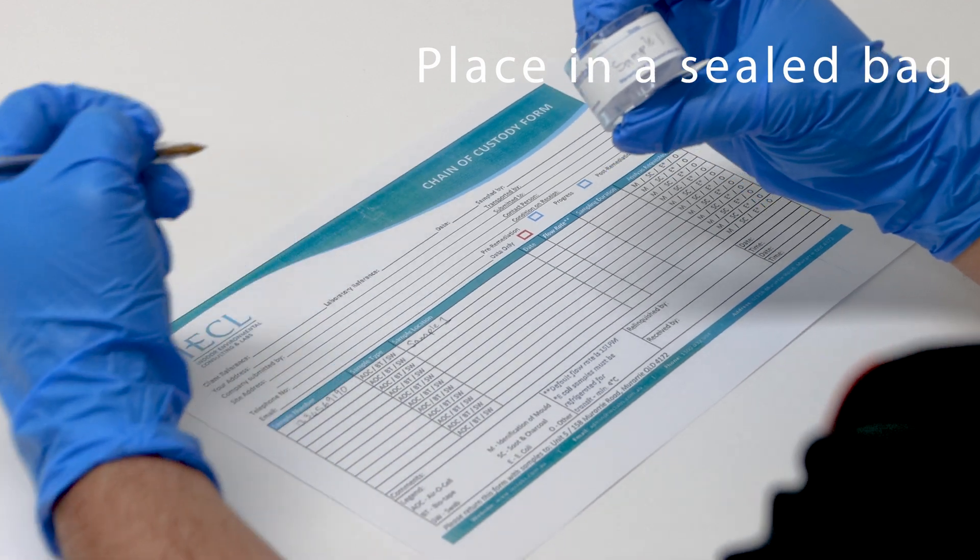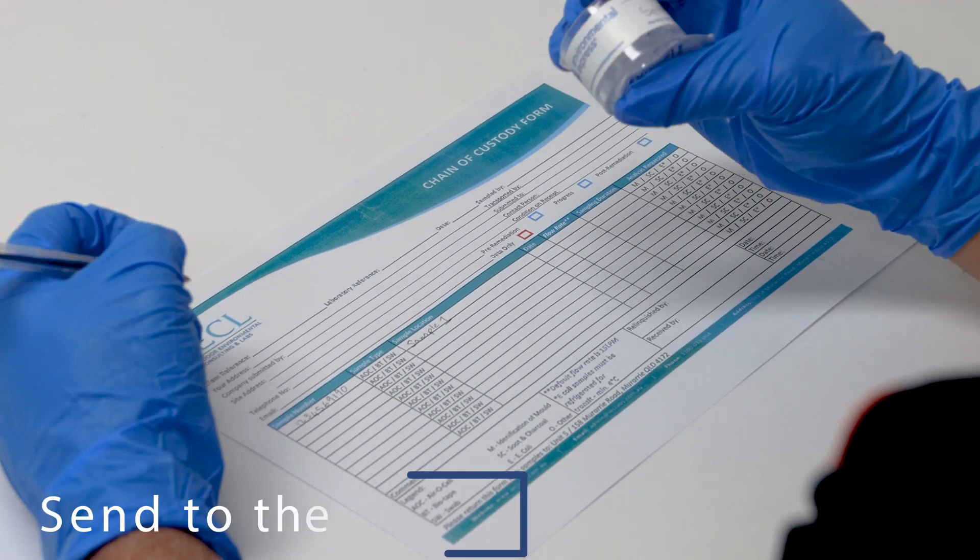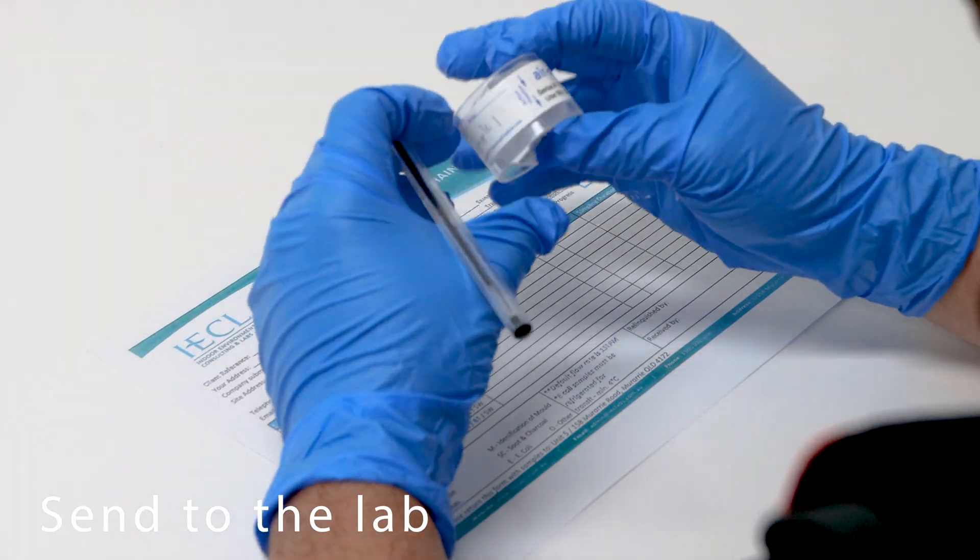Once completed, place it into a sealed bag with a chain of custody form and have it sent to your lab for testing.